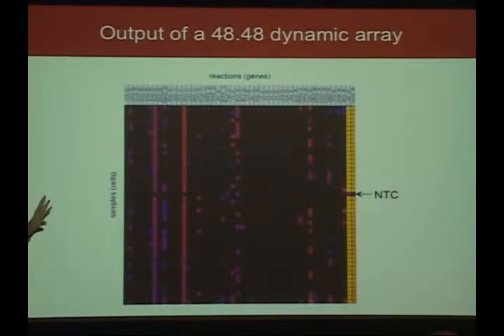But what would be good is if you designed an experiment such that you had positive control samples for each of the genes you're reading out, or at least that you had validated those reactions with those particular probes in a previous experiment where they were positive. So that's what you have to do, and that's an excellent point.